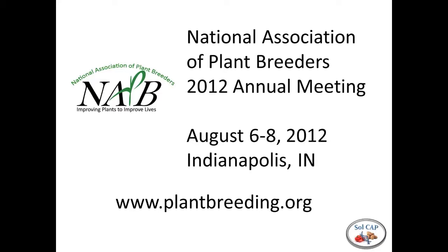Depending on the population, your genetic distance might be over or underestimated. That's typical, and not specific to Record or any other program. That's the case with all mapping software.